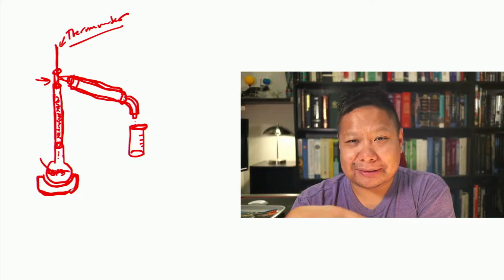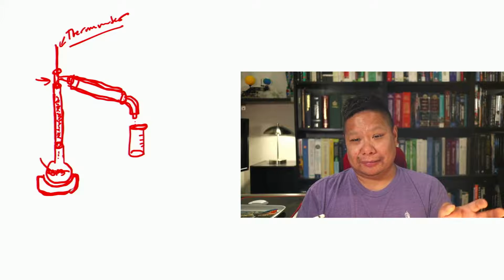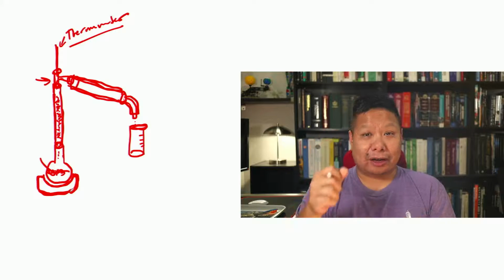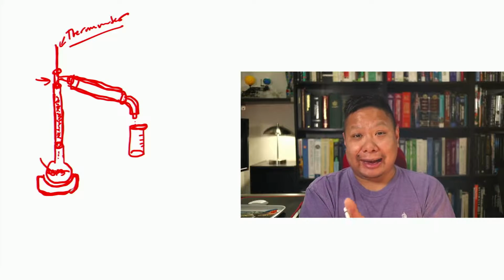So he was doing a reflux over an open Bunsen burner flame, and it was done, right? But he didn't turn off the flame, and he pulled out the fractionating column. The solvent he was using was ether, and you can smell ether from a mile away. So ether vapors were just overflowing from the flask, and the flask literally catches on fire in his hand.